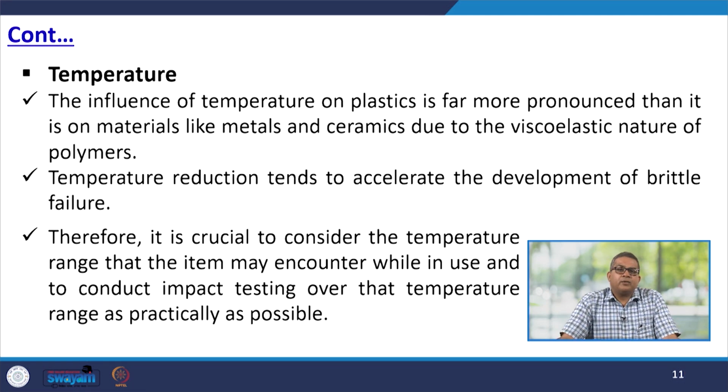Another factor in question is temperature. The influence of temperature on plastic is far more pronounced than it is on materials like metals and ceramics due to the viscoelastic nature of polymers. The temperature reduction tends to accelerate the development of brittle failure. Therefore, it is crucial to consider the temperature range that the item may encounter while in use and to conduct the impact testing over the temperature range as practically as possible.